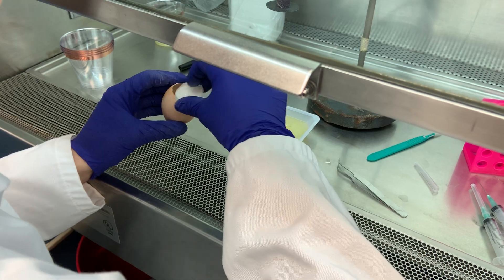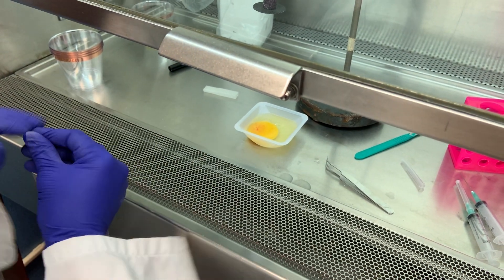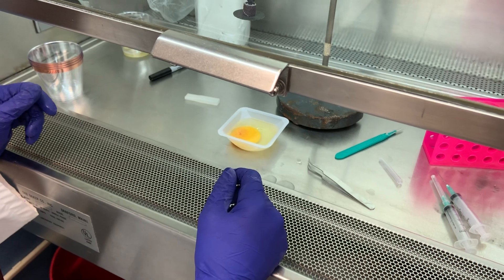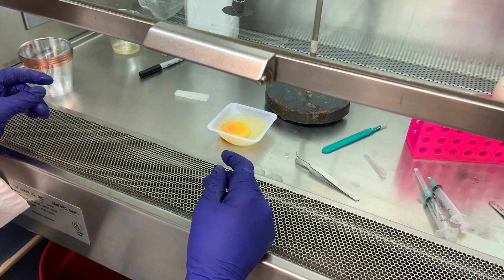So there we have a successful transfer. You can see the embryo on top. We will then put a cover on it using our square Petri dishes. And that's all there is to it.